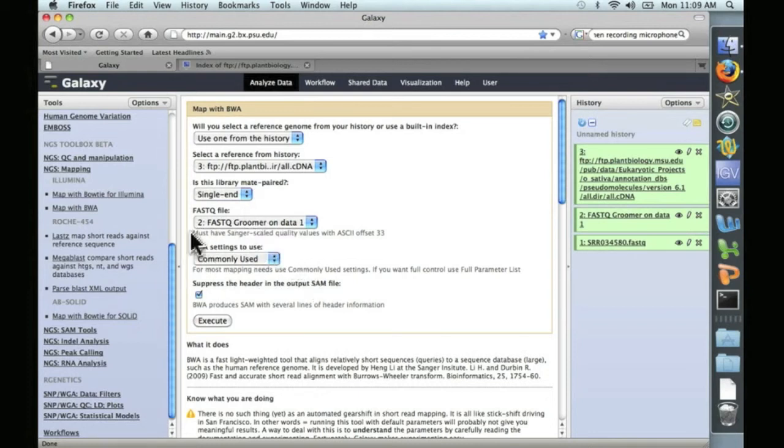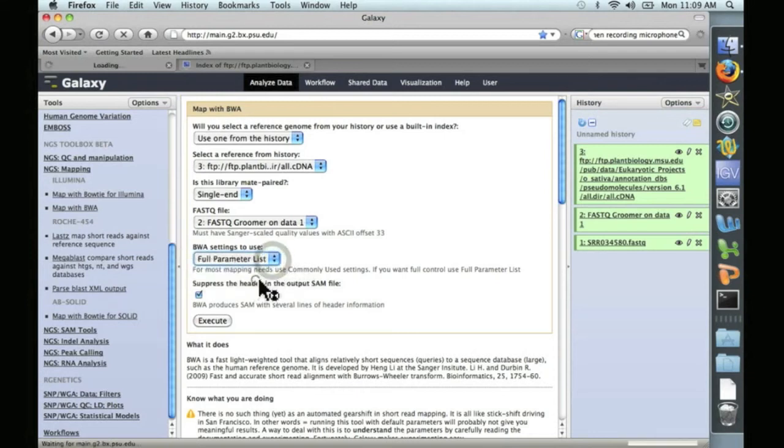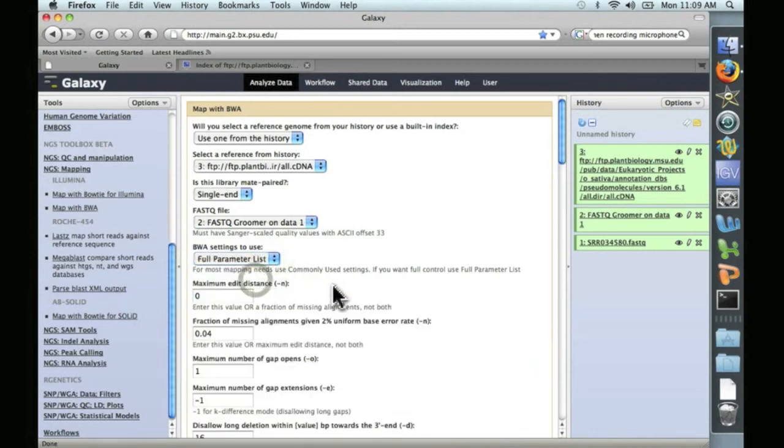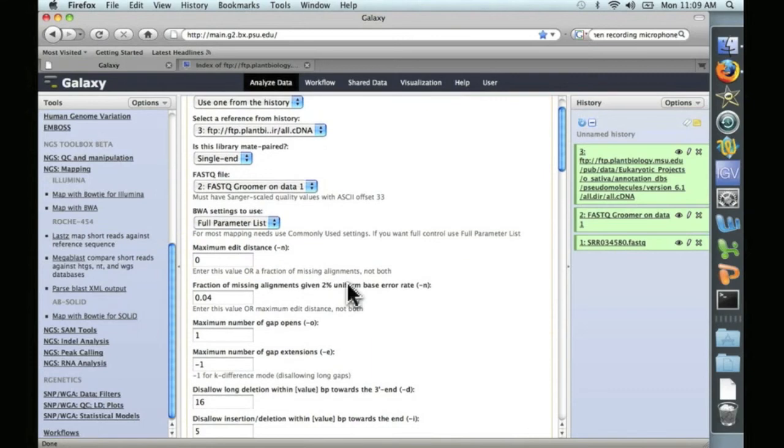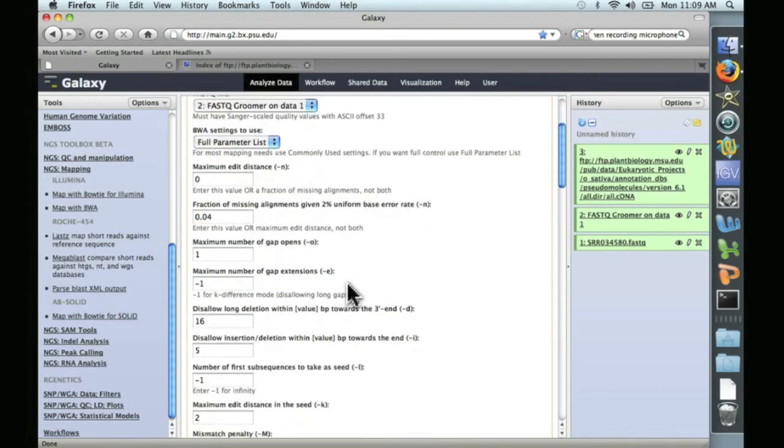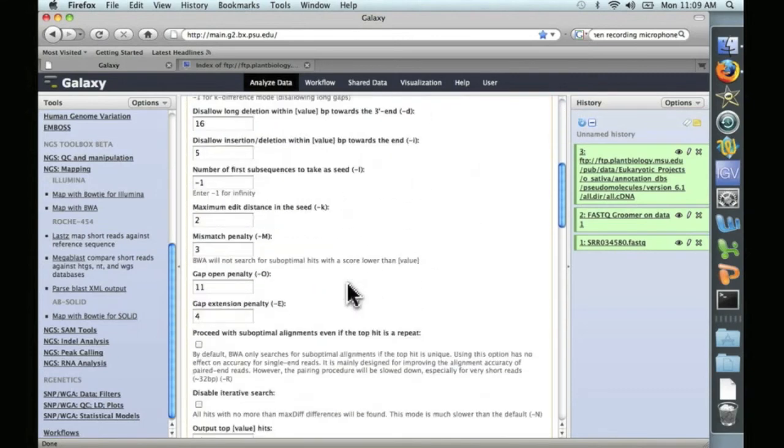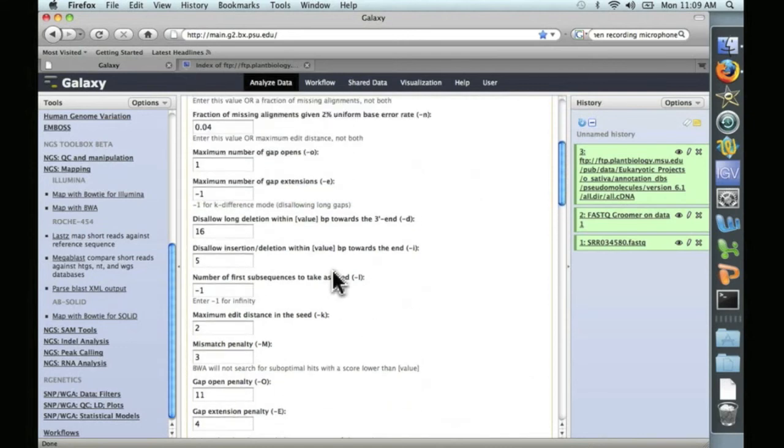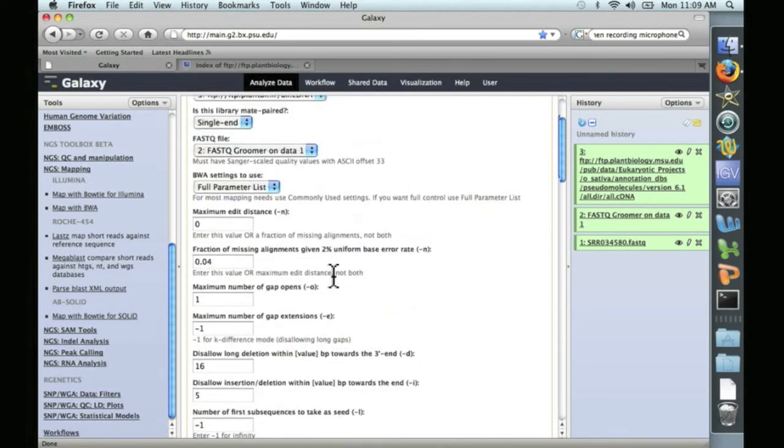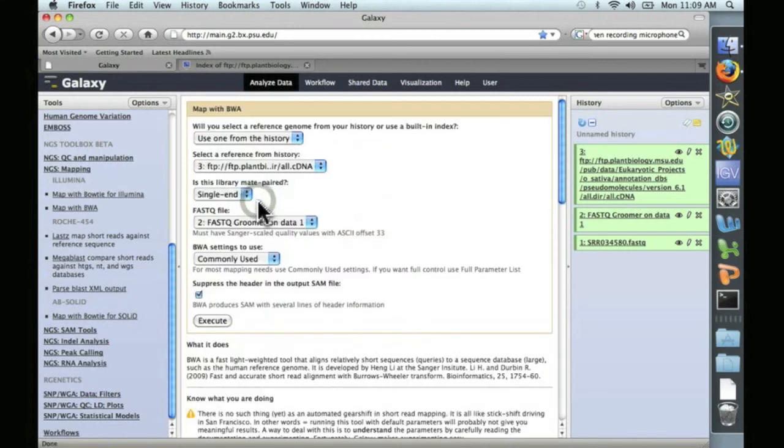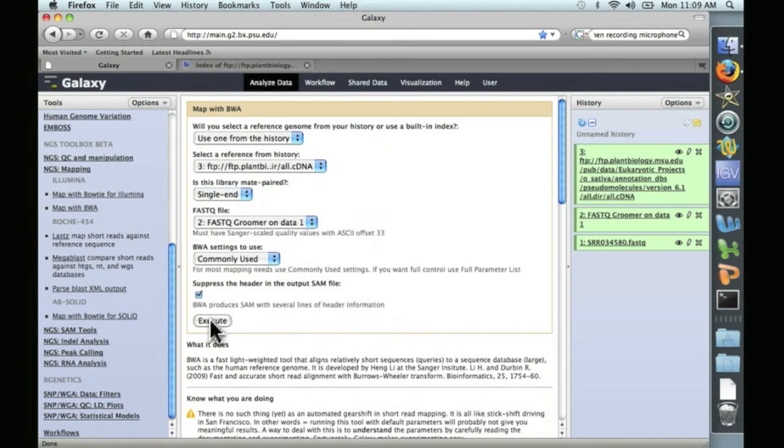Down here is the BWA settings box. And if we click on this to the full parameter list, this is where you can change all of the alignment parameters, mismatch penalties, etc. We're not going to do that right now. We're just going to go ahead and use the most commonly used settings, the default settings for our alignment. So we click on Execute.